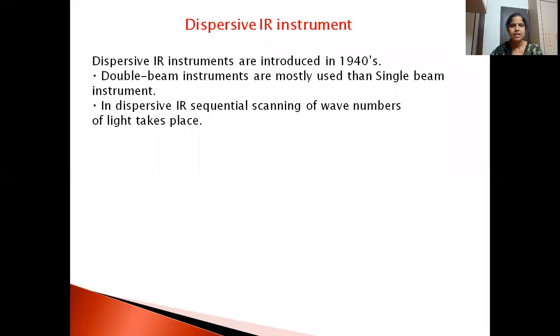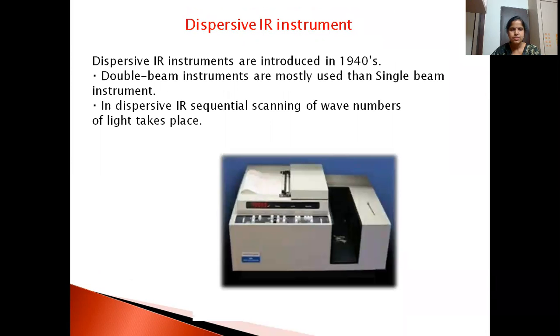Then the dispersive IR instrument. This was introduced in 1940. This is the IR instrument which is being used now.